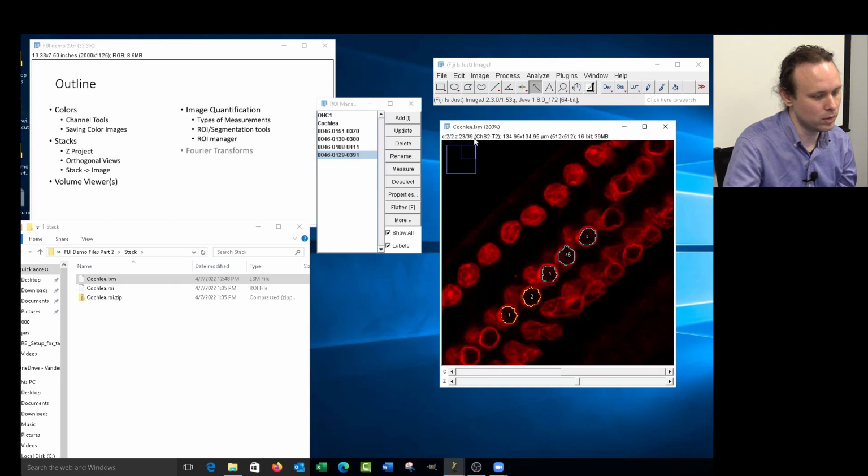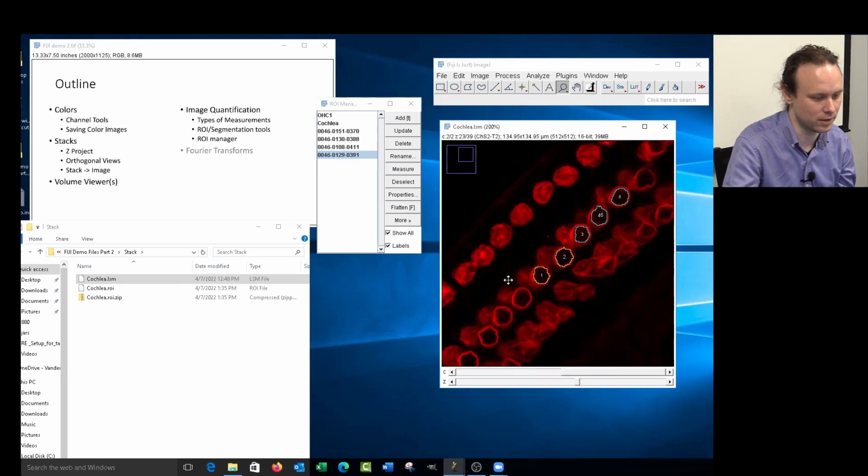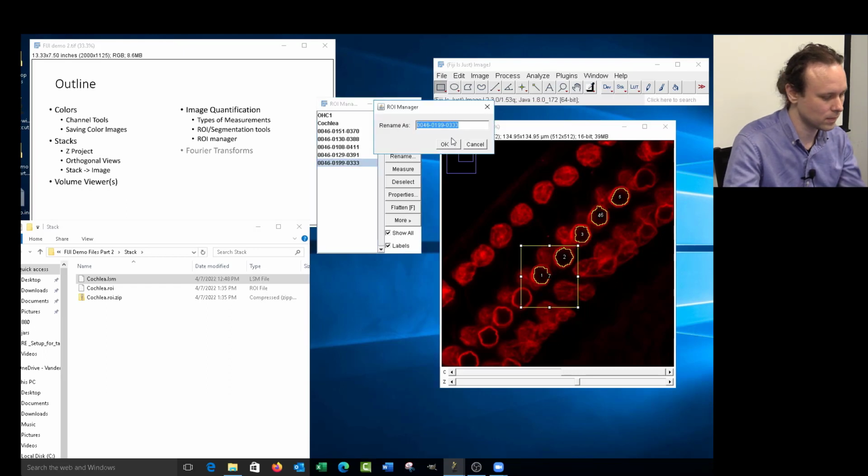Alternatively, if you want to select things based on some area, like for example, if you're segmenting something in a cell or a specific region, like let's say I just want things in this region defined by this box, so these ROIs defined in this box, then I would, well, let's make the box an ROI first. It doesn't touch 3. So I'd add that. We'll just call this region of interest.